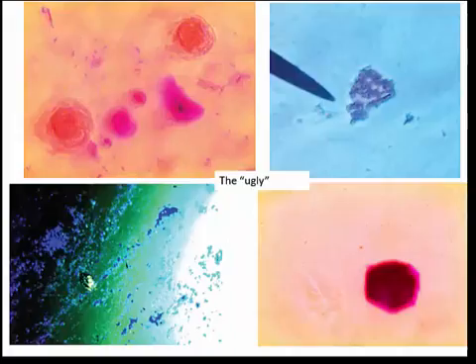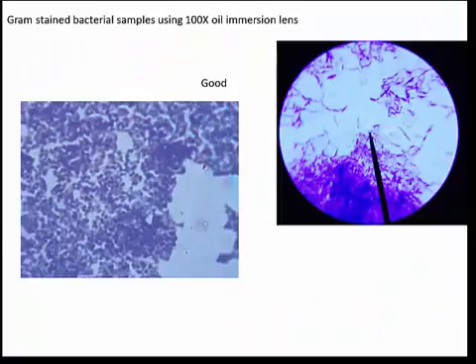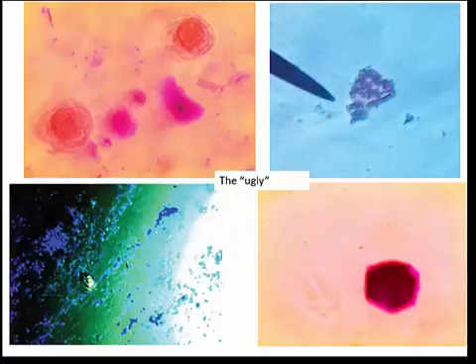Now, sometimes I'll get images that look like this, right? So, just starting out, it's hard for you to know what is real and what is not, but that's where all these images I showed you previously come into play, as well as Google image searches, right? Submitting something like this, you may be like, well, maybe these are bacteria. Well, since you've got all this weird color and contrast, that's just some weird staining artifact that's no good. This right here was just some piece of debris stuck on the slide, no good. This, just some kind of garbage, no good. None of this is good either.